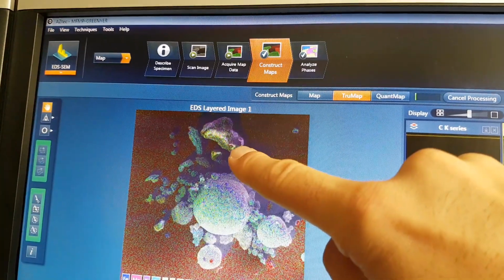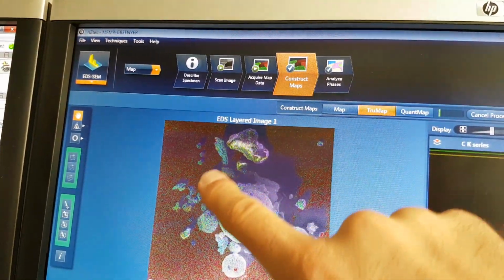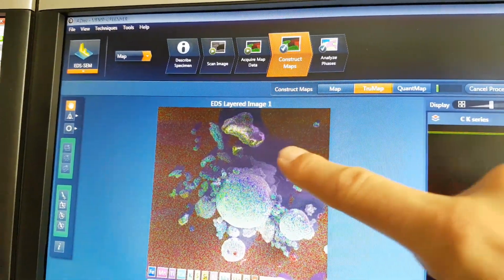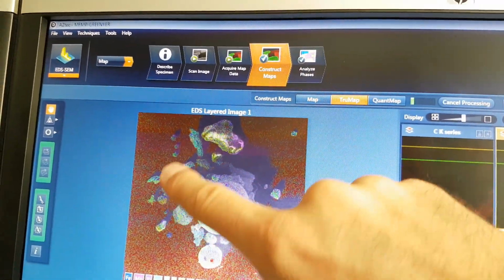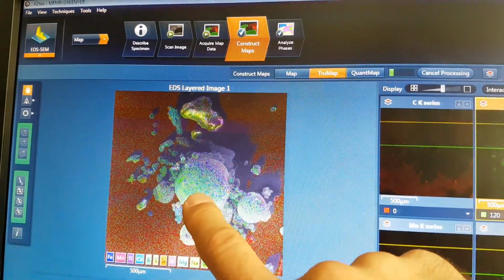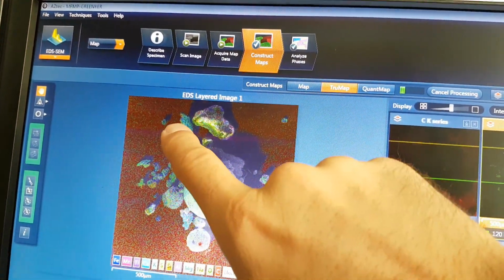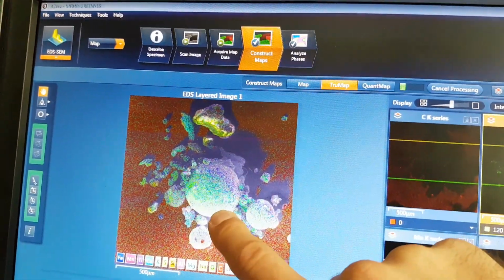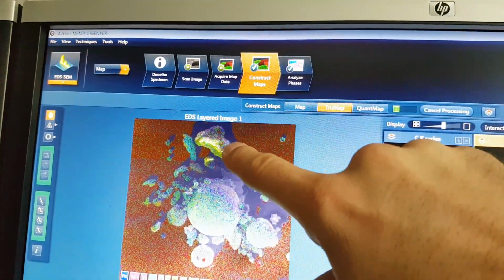So this blob, which is quite silvery looking, and these spheres. And there seems to be a lot of spheres. And I think George was saying what happens when the metals get formed, they conglomerate in the plasma, then they get too heavy to be sustained in the plasma and they drop to the bottom. I imagine this ball was a lot of these little balls that were still molten and it fused into a large ball. So I expect these little balls to be the same as this big ball, but this looks like it's something different.